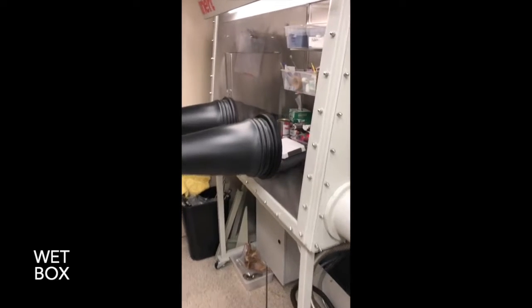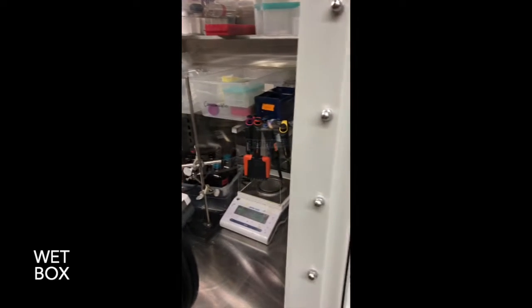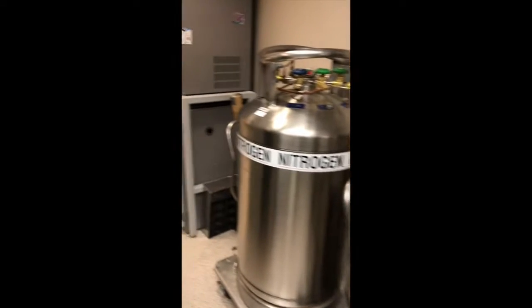But we have a second box that's for working with air sensitive proteins, the wet box, and you see more molecular biology type stuff in there.